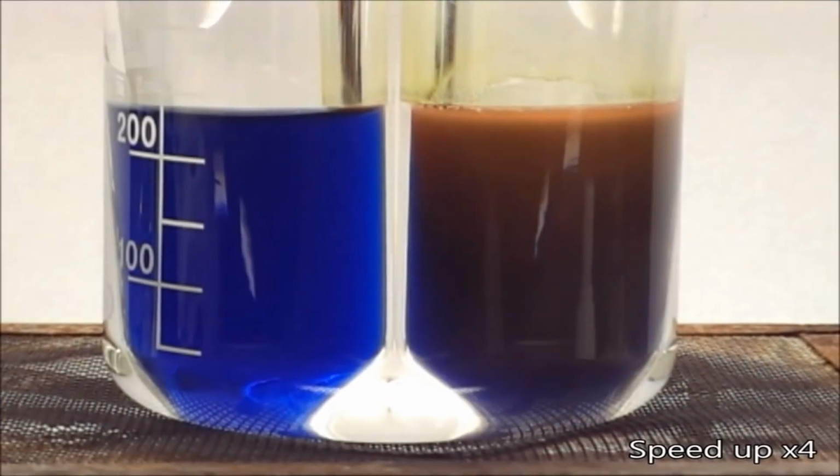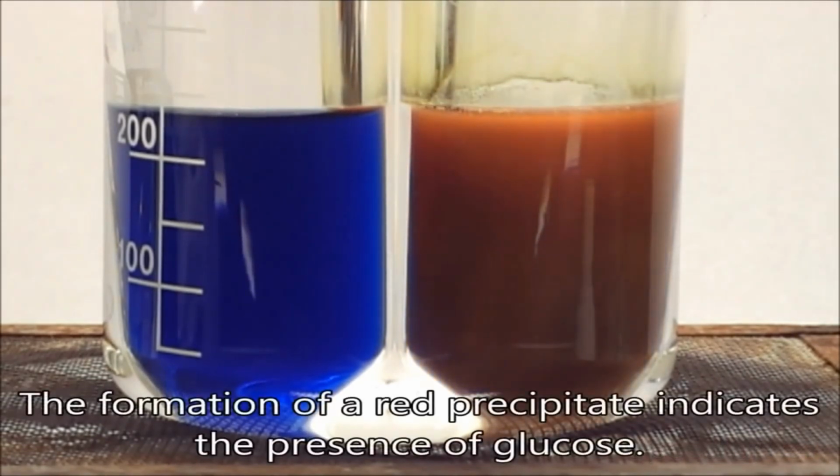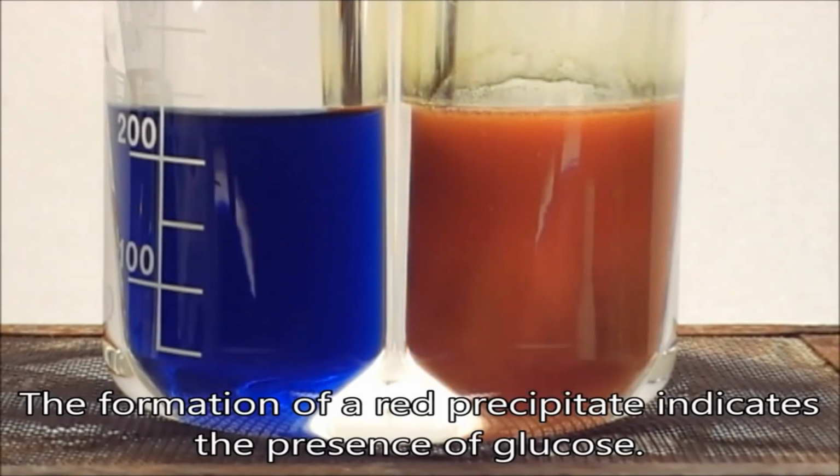Did you see the change in color? So the formation of a red brick precipitate indicates the presence of glucose, the presence of reducing sugars.